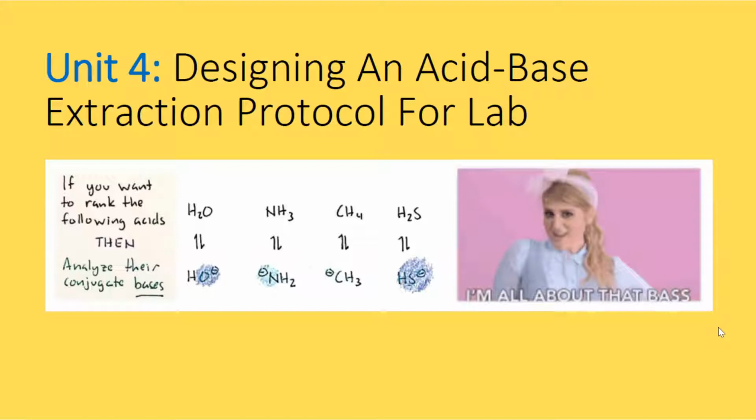Unit 4 is about acids and bases, and I'm going to use several concepts that you learned about when you learned about acids and bases to design an extraction protocol to separate three molecules that are dissolved in chloroform. And as Megan Trainor says, it's all about that base.